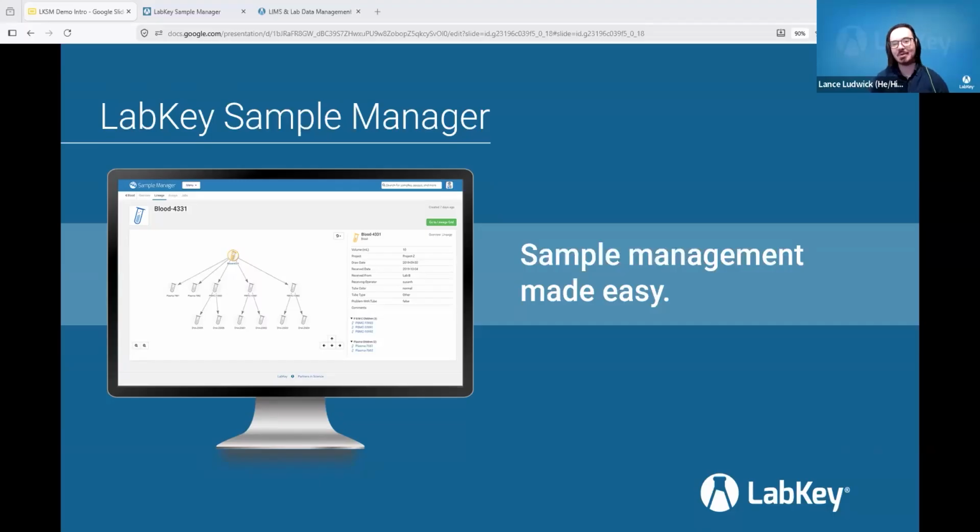My name is Lance. I'm a senior product specialist here at LabKey. I help folks evaluate Sample Manager, see if it's the right fit for them, and then I help with onboarding and serving as customer support.